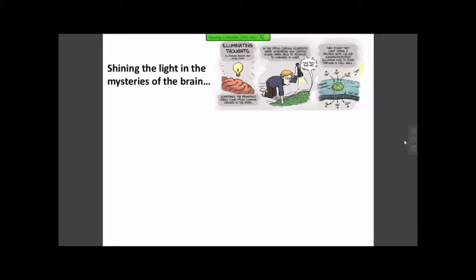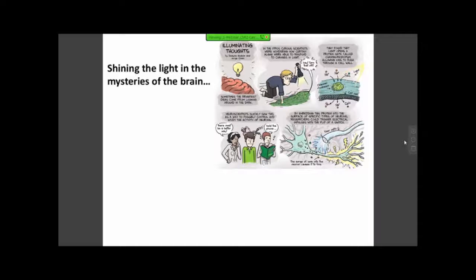So I would like to start my talk with this comment I found on the web, which is showing how optogenetic technology started entering into the scientific world. More than 20 years ago, scientists discovered that unicellular organisms can change their function upon light stimulation. In particular, they do express ion channel proteins, which can be activated by light, and they can induce protons or ions flux through them. So they thought this might be a very interesting technique, in particular for the modulation of, for example, electrical activity of neuronal cells.